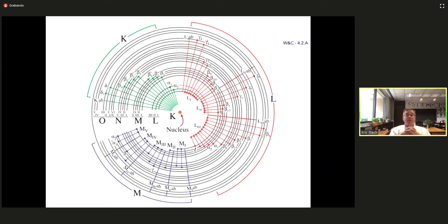You're better off going to the XFM beam line, the SRX beam line at NSLS2, and probably doing the tomography, the chemical tomography that you learned about from Ming Yuan. Yeah, Ming Yuan taught us that, right? So Ming Yuan was the one who taught about doing X-ray fluorescence and tomography. That might be the better approach if you're looking at something big.